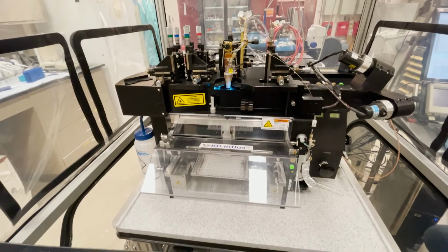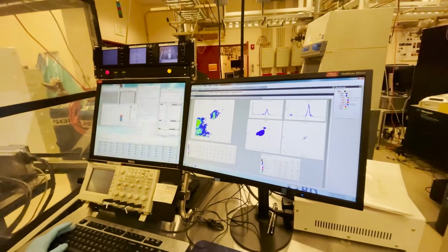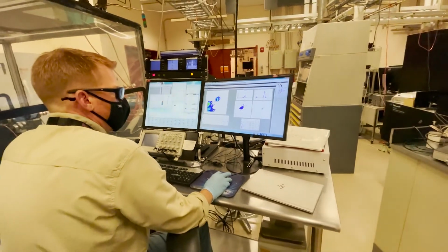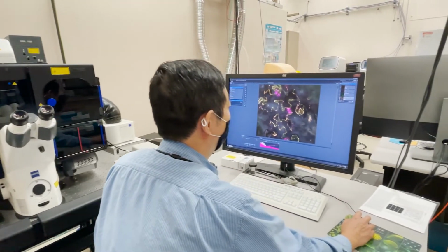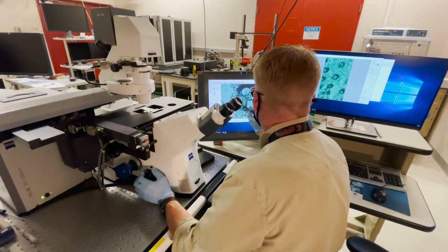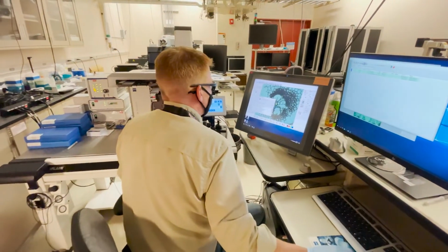Enabled by next-generation single-cell sequencing and nanoPOTS proteomics, we capture micron-scale heterogeneities in gene and protein expression profiles, which otherwise would be lost using traditional bulk analysis. Single-molecule and super-resolution fluorescence microscopy helps us visualize these processes in live cells with nanometer-scale resolution, shedding light on the dynamics and mechanisms of interactions within complex microbial systems.